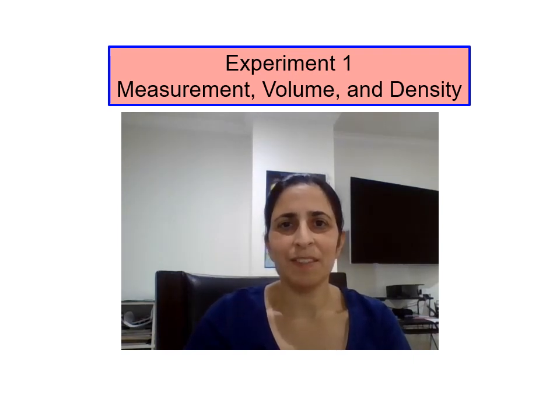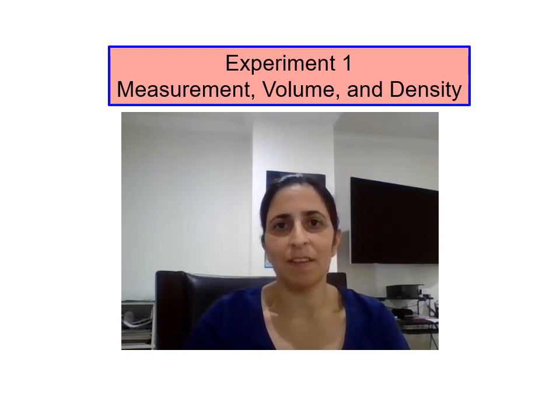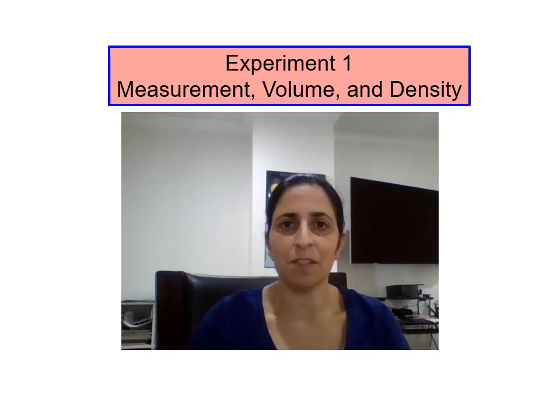Everyone, what we're going to do today is go over experiment 1, measurement, volume, and density lab, and then you guys are going to do the rest of the experiment. So I'm just going to go over some background information about the experiment first.